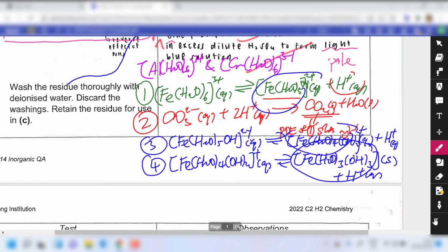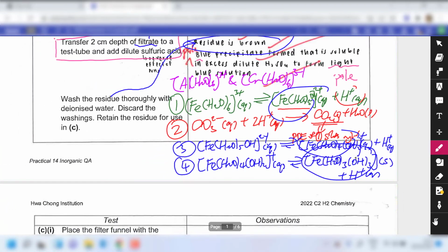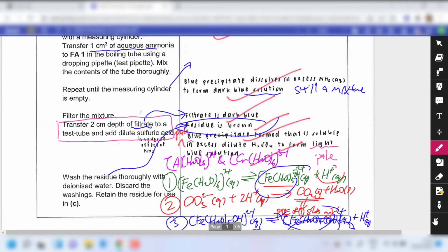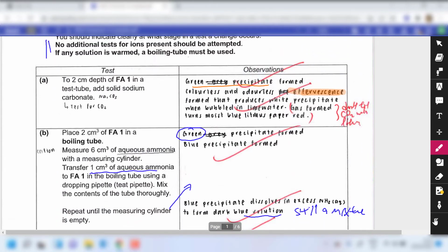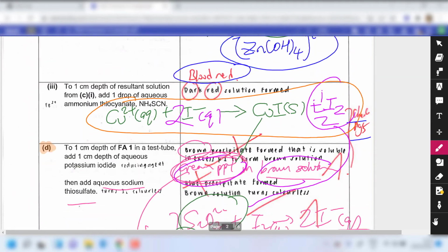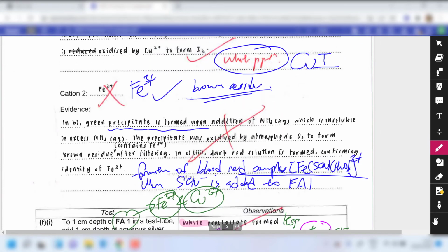Okay, yeah, so with this, I hope you have a better appreciation of the chemistry of the production of CO2 from a cation with high charge density, which I didn't explain earlier on. Yeah, I spent a lot of time trying to explain part B, but didn't really spend time talking about part A.